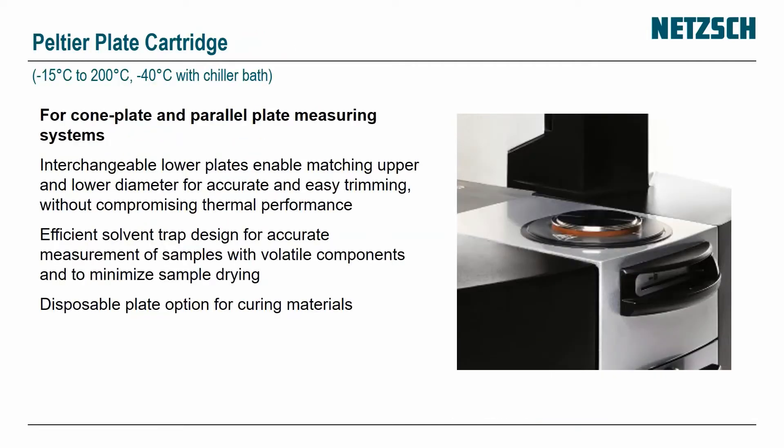Let's have a quick look at the cartridges. We have a Peltier plate controller which goes from minus 15 to 200 degrees C, or minus 40 if you want to add a chill bath. It can accommodate different disposable plates and a solvent trap, and you can change the lower plate for matching upper and lower diameters.